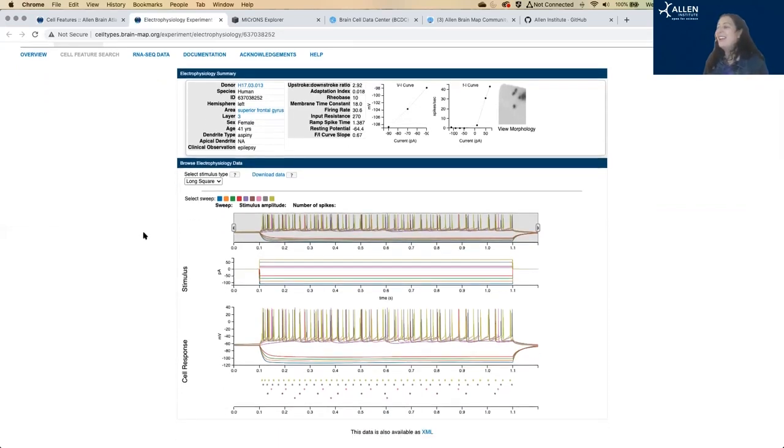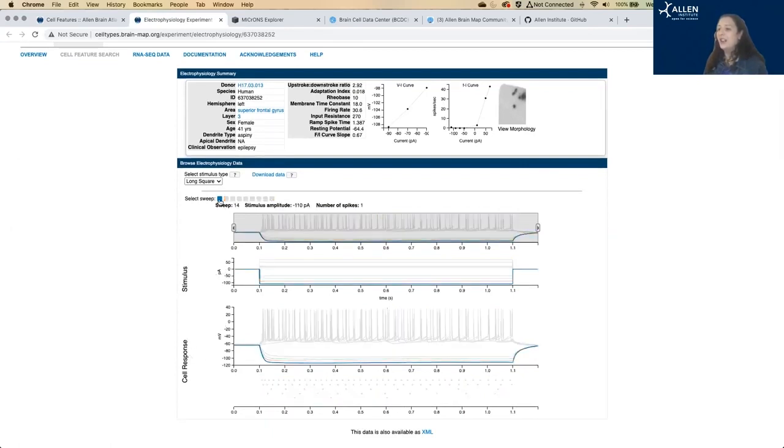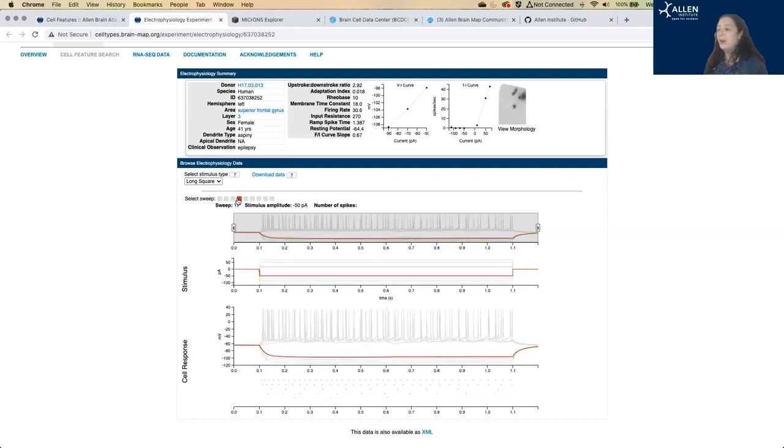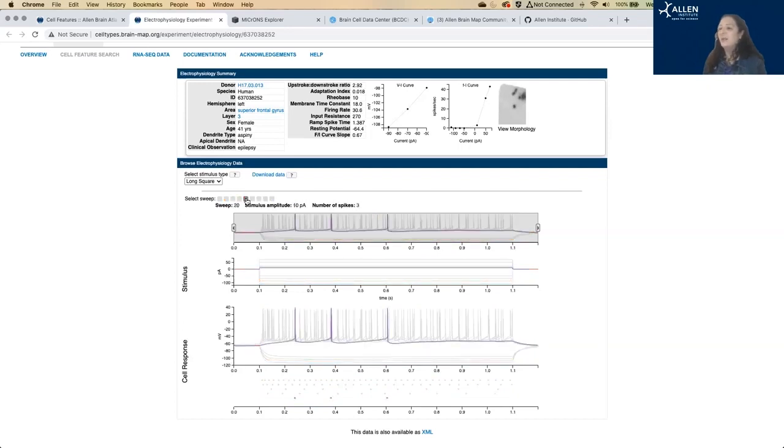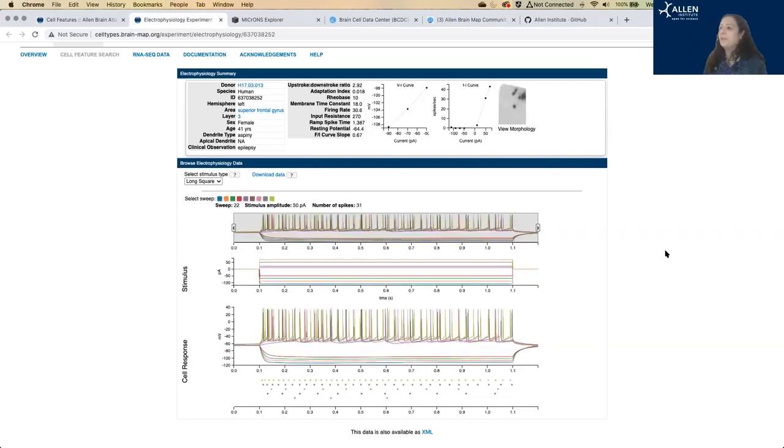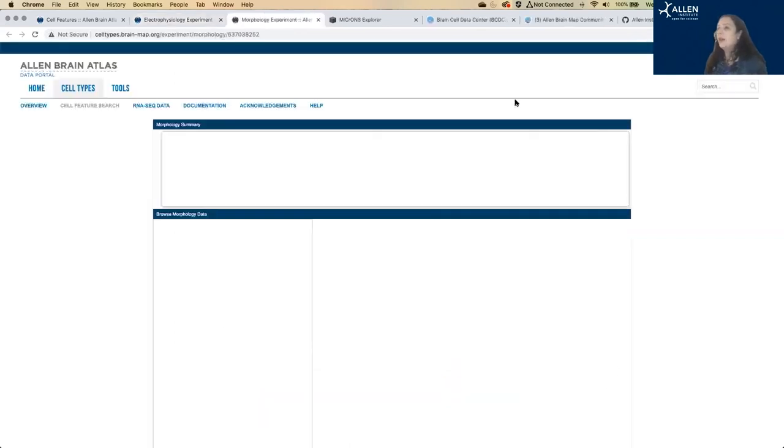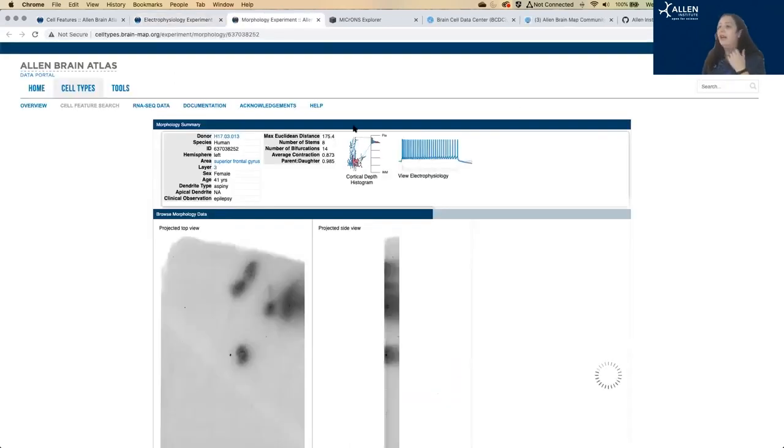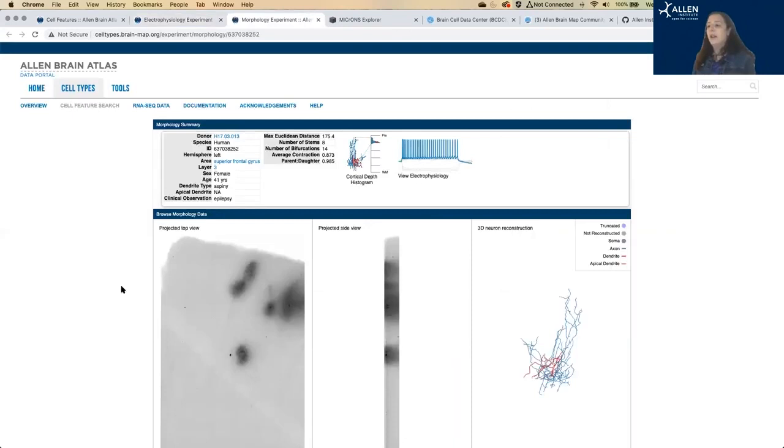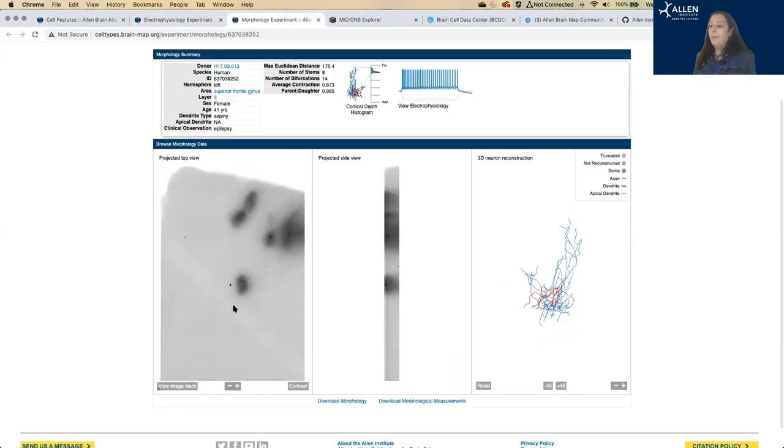So in our electrophysiology data, what we have is the stimulus that was put into the cell and then we have the cell response. Each color represents one sweep in the stimulus and the cell's response. We've precalculated some basic characteristics of this cell that would be useful for a lot of uses. And you can also view this cell, both what it looked like and its reconstruction.